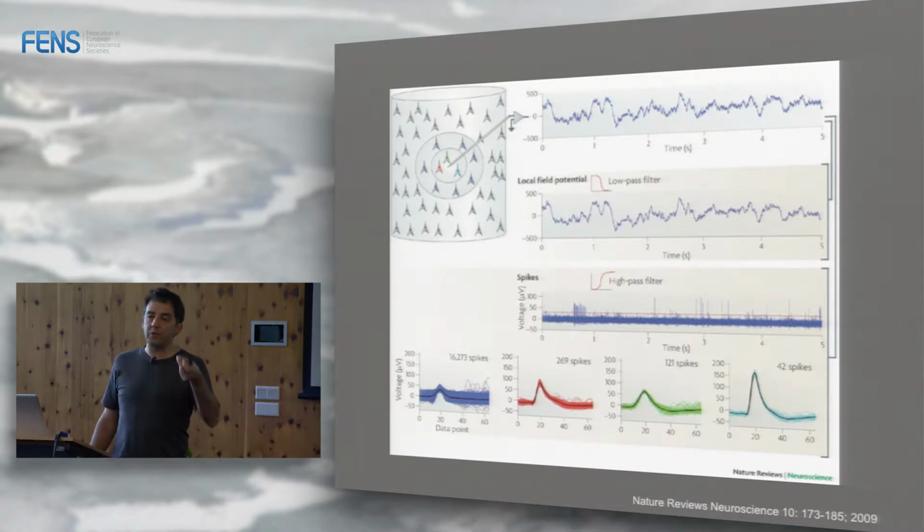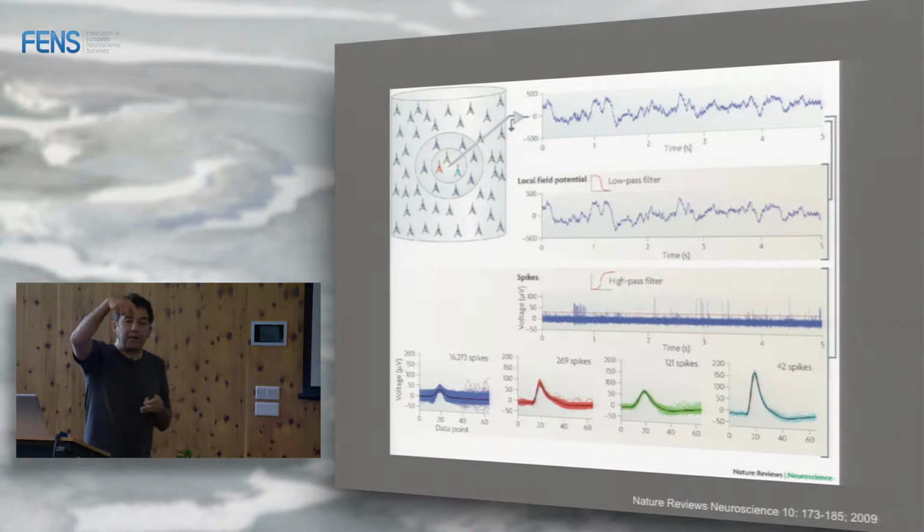Why is that? Because neurons tend to fire spikes of different shapes. I will explain you this in a second, why is that, right? So if you record there, one neuron will have one shape, another neuron will have another shape, and so on. This doesn't always happen, but this is our assumption. I mean, we start from that. If this won't happen, we're lost. There's nothing we can do.